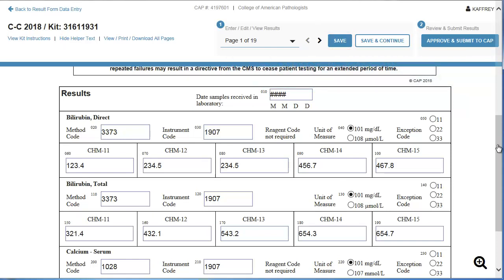Assume you don't have to make any changes to this page, so use the arrows or drop-down menu to review all other pages one by one.